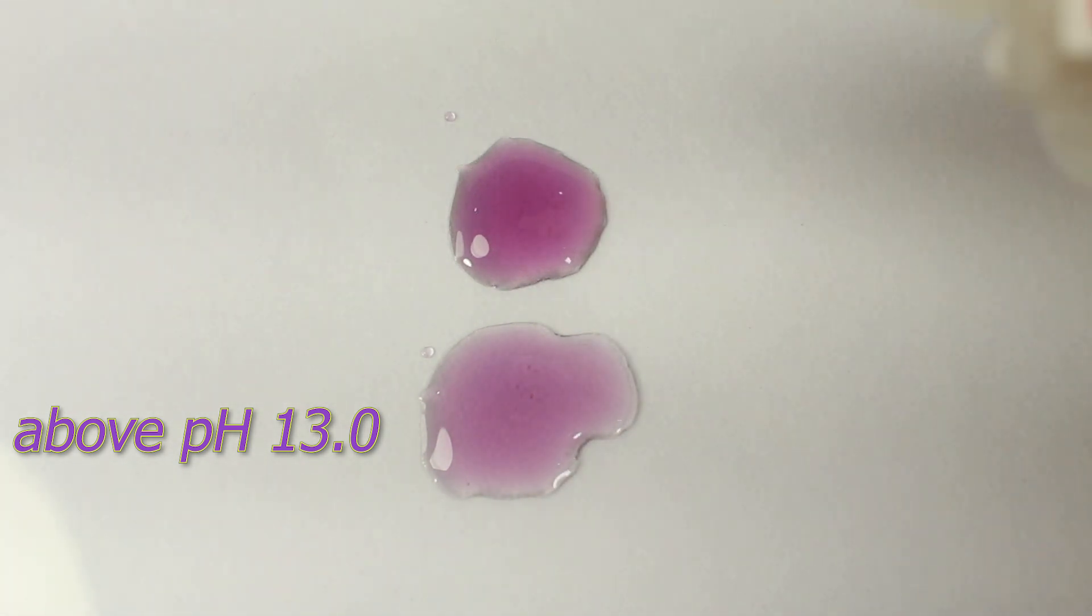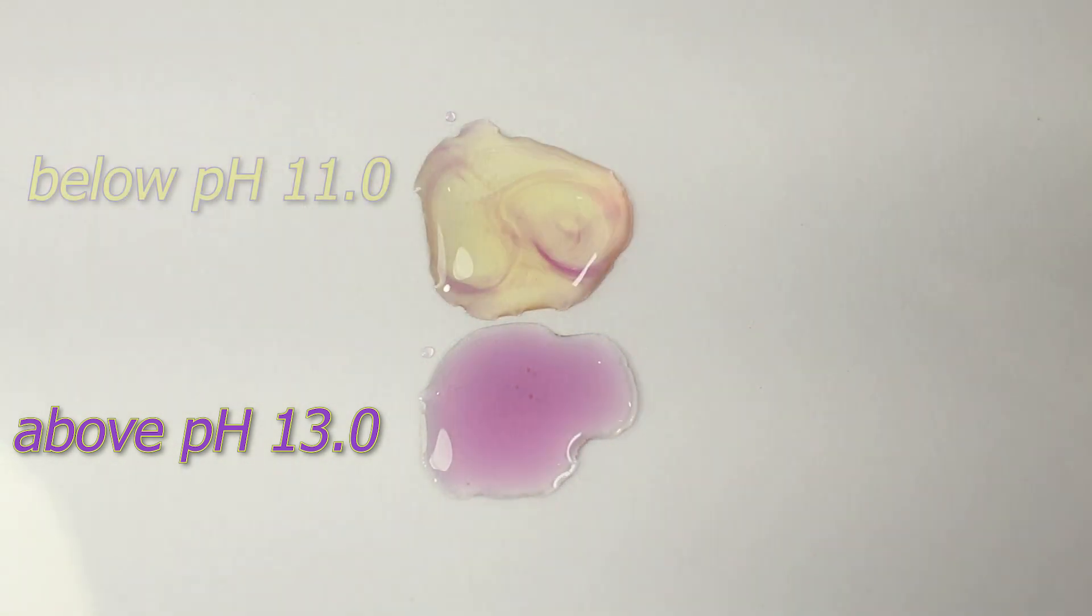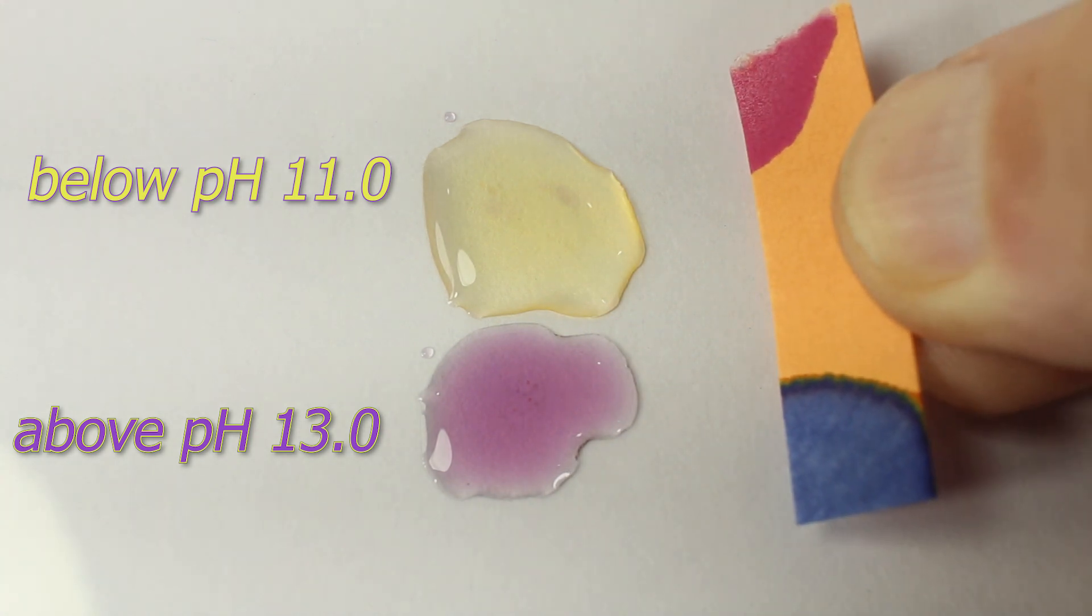What happens if I change the pH by adding some sulfuric acid? It turns yellow. Actually yellow is the color of this at any pH below 11. It can be used as a pH indicator also.